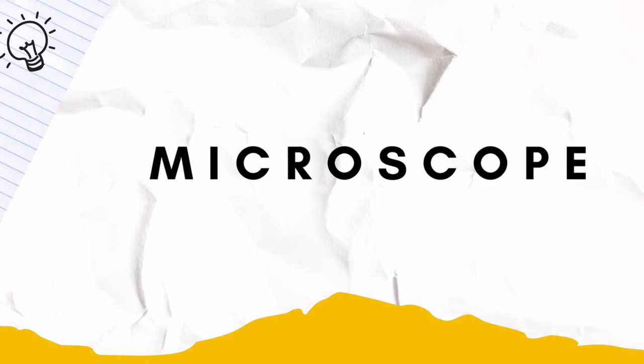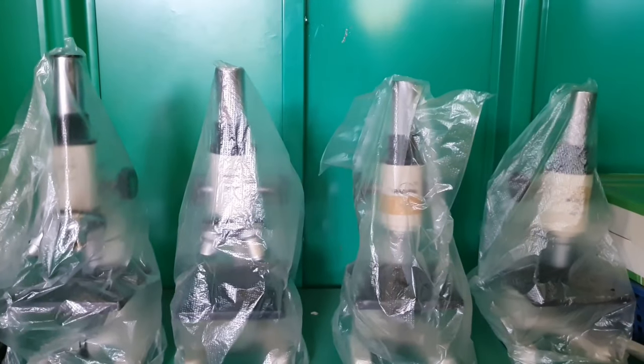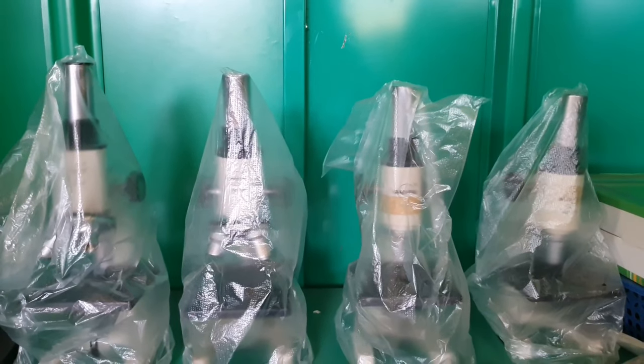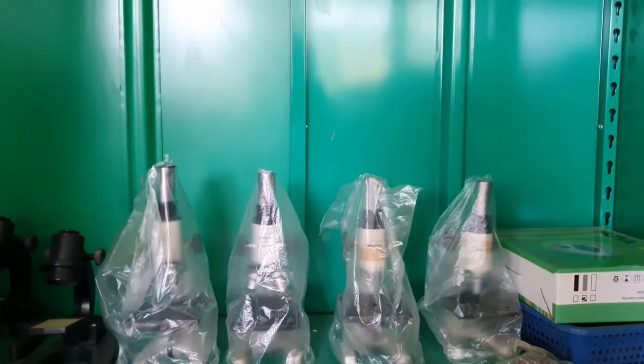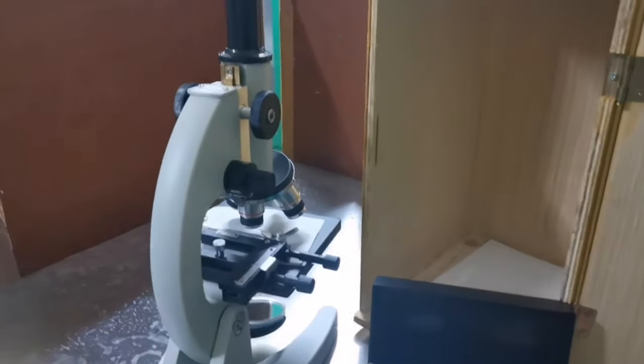Microscope. A simple microscope is used to see the magnified image of an object. Anthony van Leeuwenhoek, a Dutch, invented the first simple microscope.